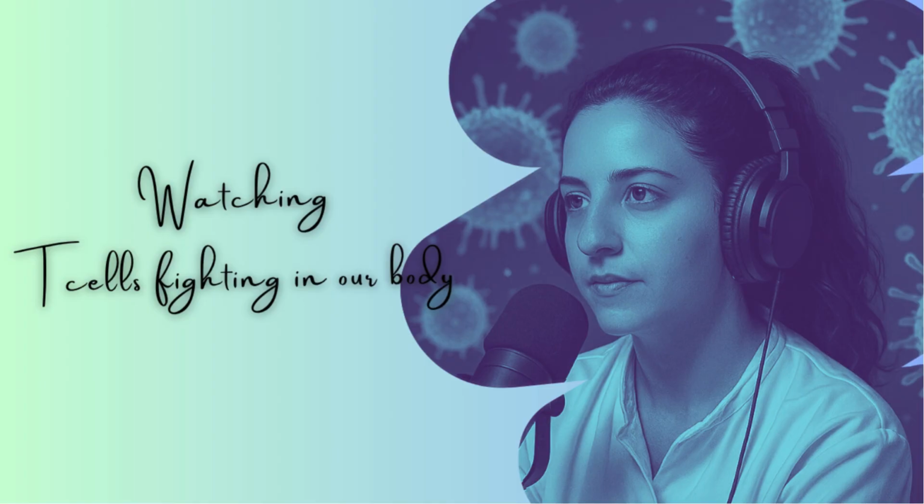So, for those who don't know what flow cytometry is, imagine this: you have millions of cells in a tiny tube. Some of these cells are T cells and some aren't. Some are activated, some are exhausted, some are making cytokines, and others are just floating by. With flow cytometry, we can take that mix and analyze each cell individually, one by one. As they fly past a laser beam at high speed, each cell is tagged with fluorescent markers, glowing labels that attach to specific proteins like CD3, CD4, CD8, CD45RA, CCR7, and more. When the laser hits the cell, it emits a light signal, and that signal gets turned into data points, graphs, and plots. It's a very fast technique, it's powerful, and it's the gold standard for tracking immune responses.